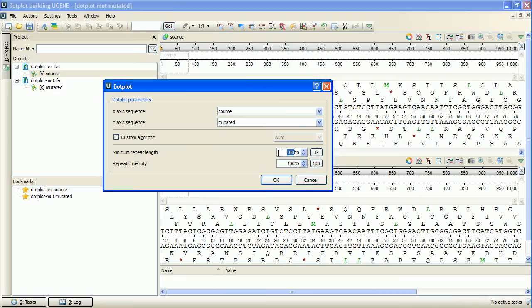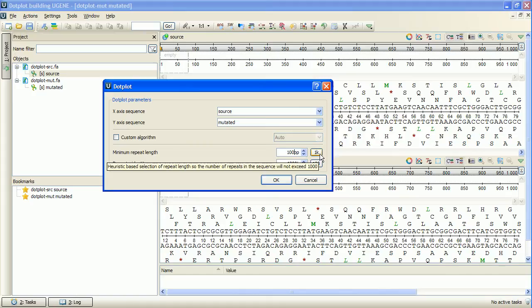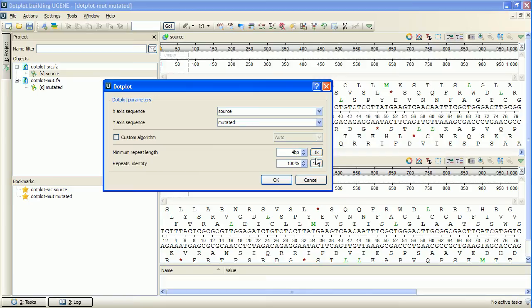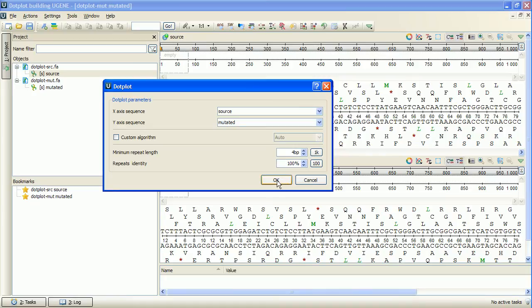Selecting too small repeat-length values can clutter the plot with matches, and selecting too high values can filter useful details. To select the repeat-length value corresponding to about 1,000 results, simply click the 1K results button. Repeat identity value is 100% by default, but it can be adjusted if needed. The options are set and I press OK.